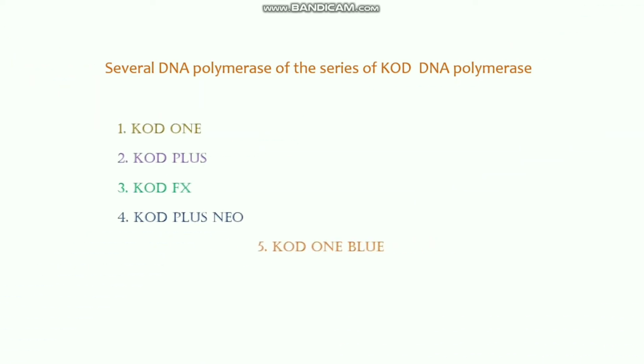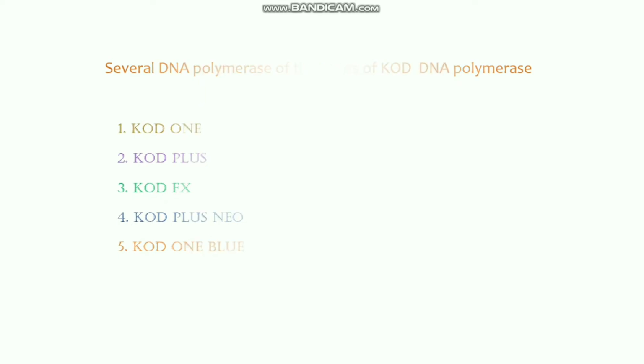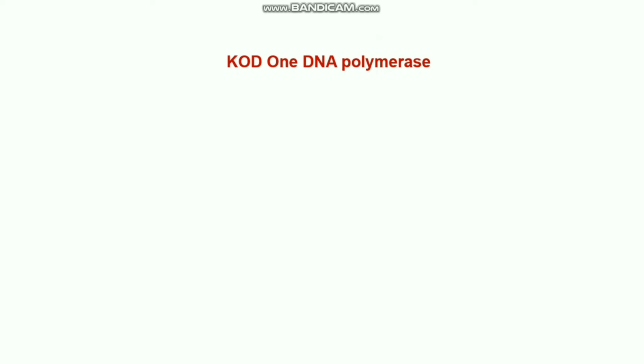These products are KOD1, KOD plus, KODFX, KOD plus Neo, KOD1 Blue, and there are also other KOD polymerase products, but these are the most important KOD DNA polymerases available in the market. So next I want to talk about the KOD1 DNA polymerase. Actually, this is the most highly efficient DNA polymerase in the KOD DNA polymerase series.